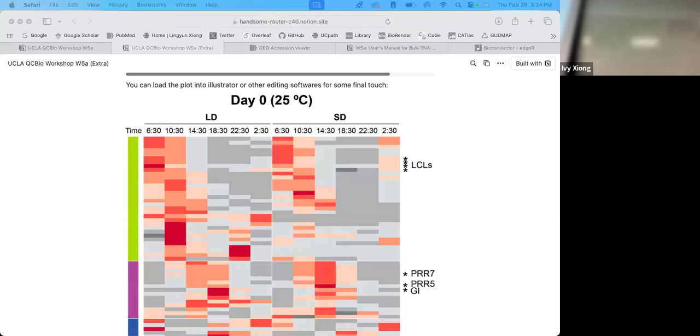And then go to your download, go to where the file is, where we first downloaded. So here's two. I don't think you downloaded it to the download folder.